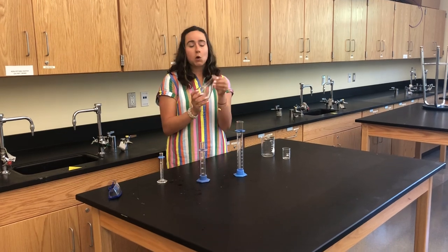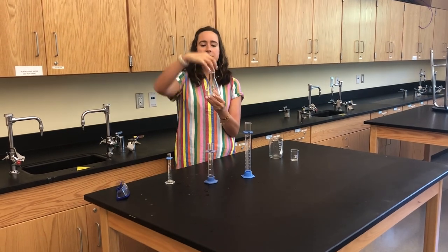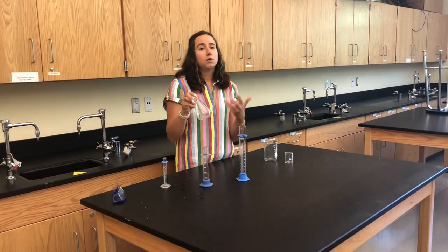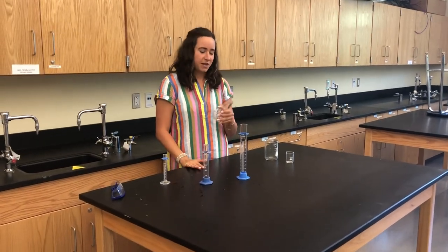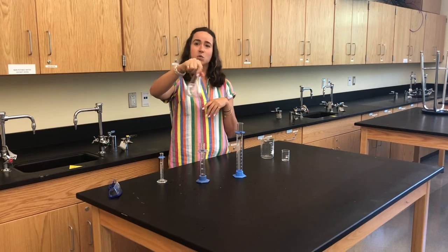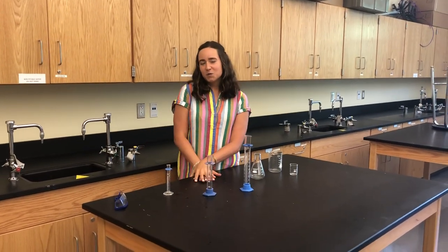The last common piece of glassware is called an Erlenmeyer flask. It's very similar to a beaker except it curves in towards the top with a little stubby neck that we can hold on to. We also use Erlenmeyer flasks for holding liquids — not measuring. We mix liquids together by holding on to the neck and swirling around, and because the neck is angled, it prevents the liquid from splashing out as we mix. That covers our most common glassware, so make sure you keep track of which is which and use them accordingly.